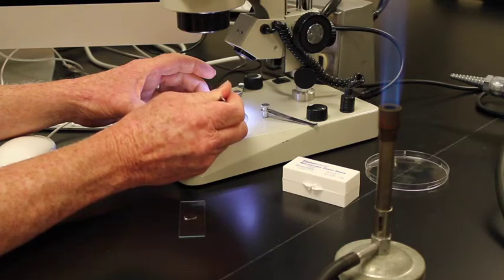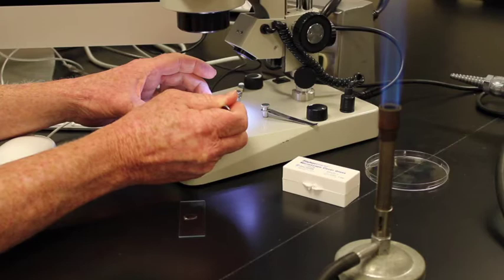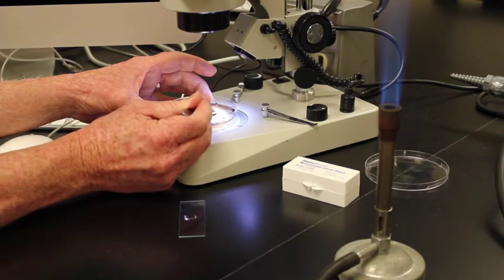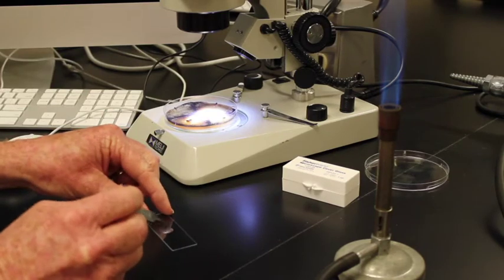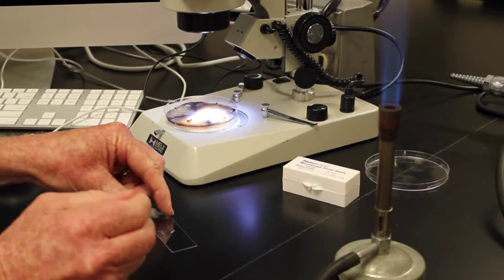I'm just going to scrape carefully off some of these perithecia. I don't want to get any agar off of the plate, right? I'm kind of taking it back and scraping it like I'm shaving these little guys right off of there. I'm going to take all of these guys and I'm going to put them into the water.